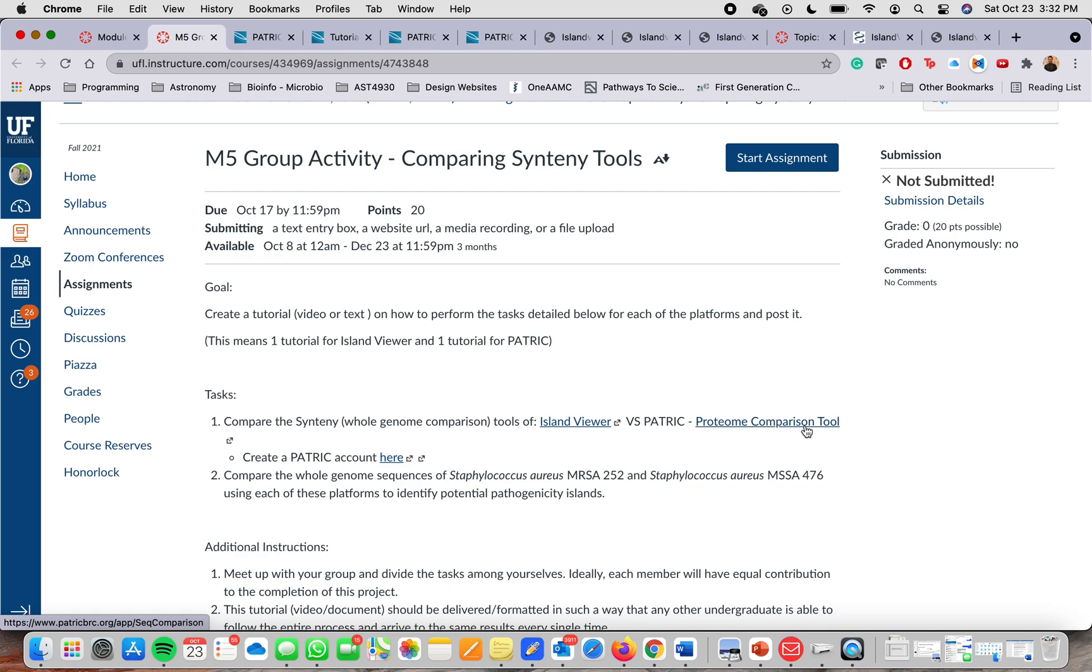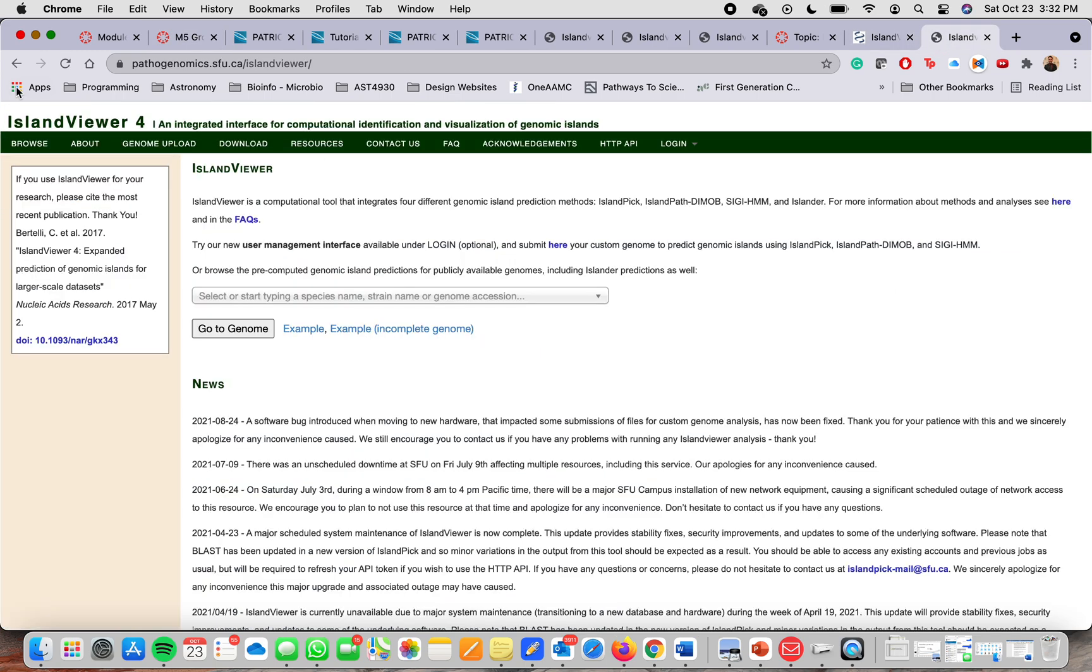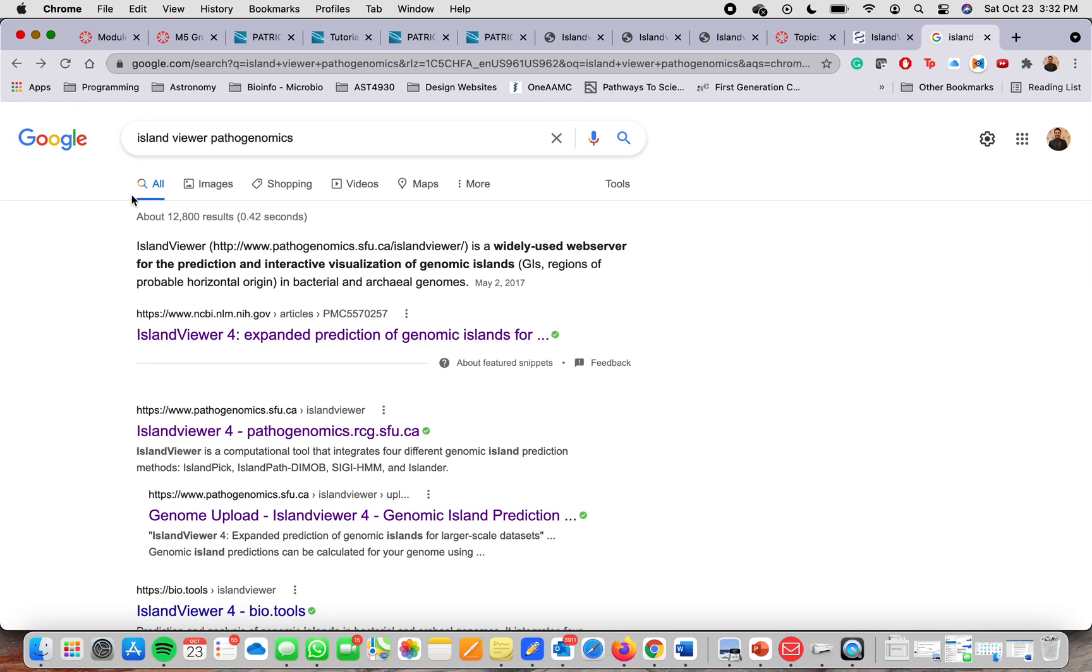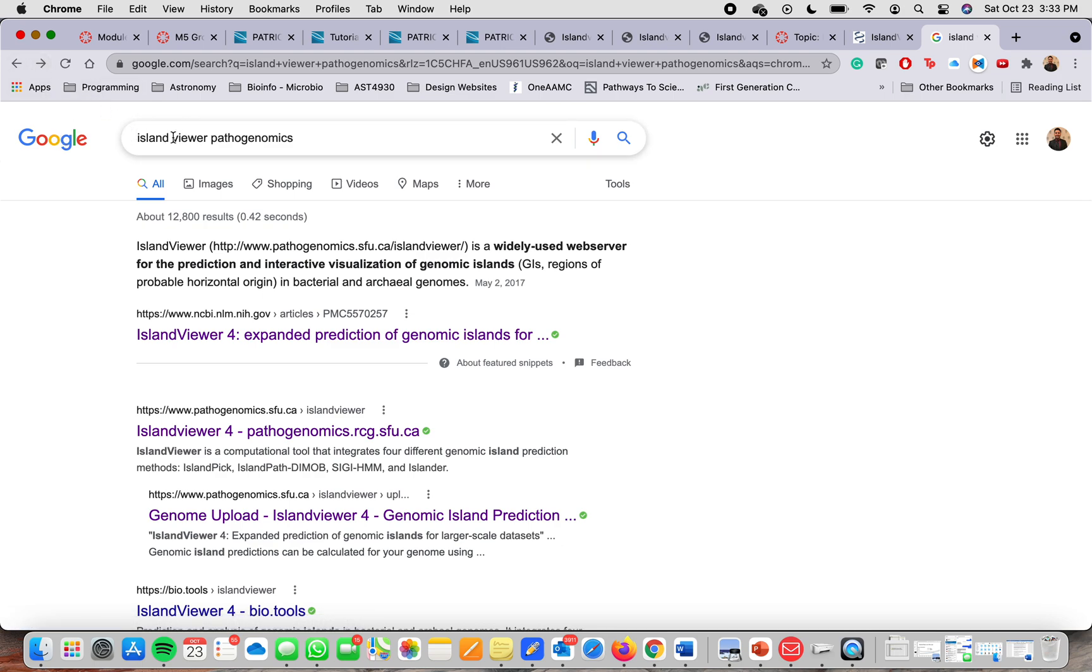The first one that I'm going to use and explain in this video is the Island Viewer one which you already look up here. I got it from the link that the professor provided but I also typed this in Google.